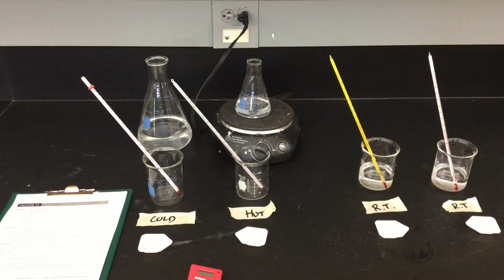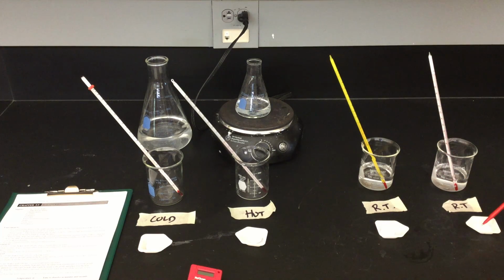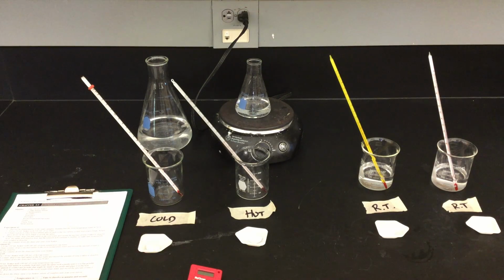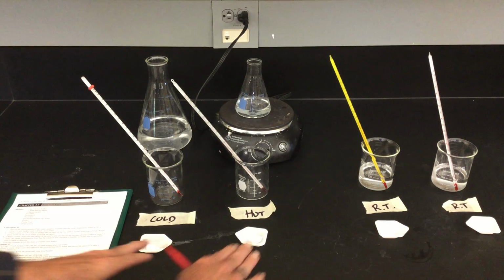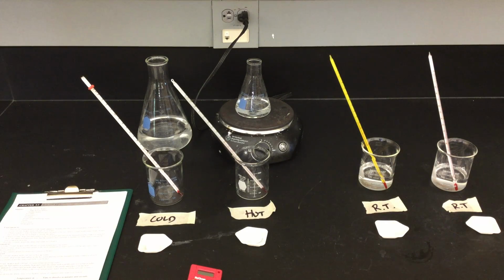What I have in here is an Alka-Seltzer, and in this one I have a crushed Alka-Seltzer. So in this case, we're going to be comparing the size of the particles, one giant particle versus all these tiny particles that are crushed. You can imagine from the lecture which of these reactions should take place faster. You can predict that based upon the information that we learned in the lecture. Also, you can probably predict which of these are going to be reacting faster. So right now you should make a prediction of these two, which are going to react faster, and of these two, which are going to react faster as well.